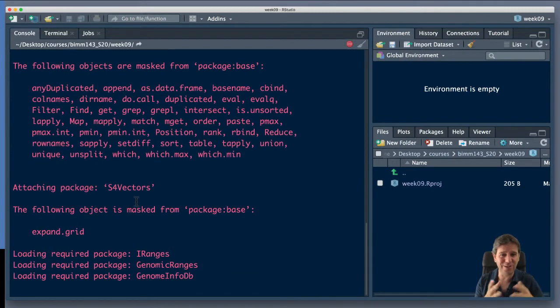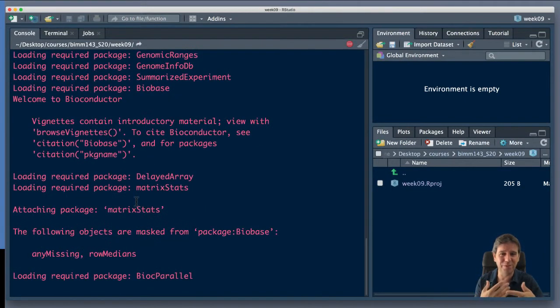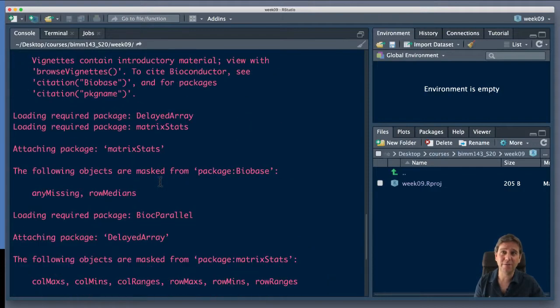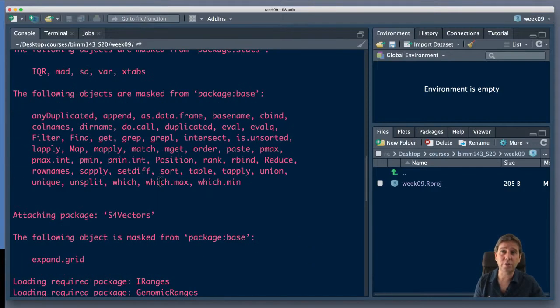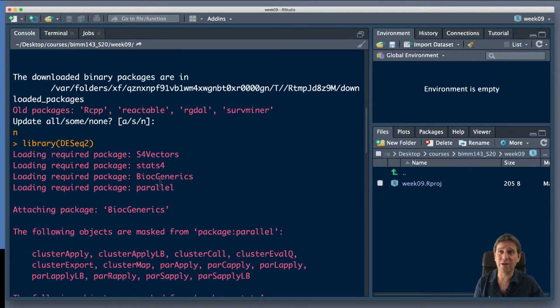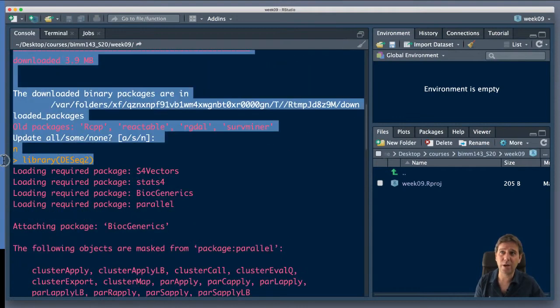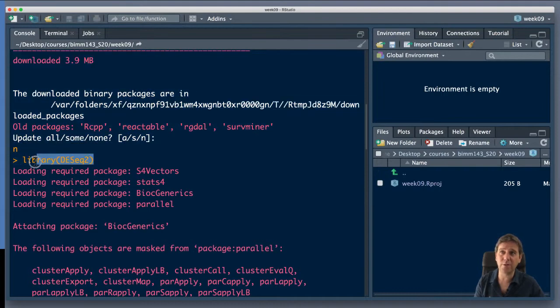It's red font because that's the theme that I have. Doesn't mean it's bad text, right? So let's go and have a look at what's being printed out here. So lots of stuff flew past here. This is the orchestra coming along for the ride here. So here's the line that I just typed. And then these are the messages being printed out.